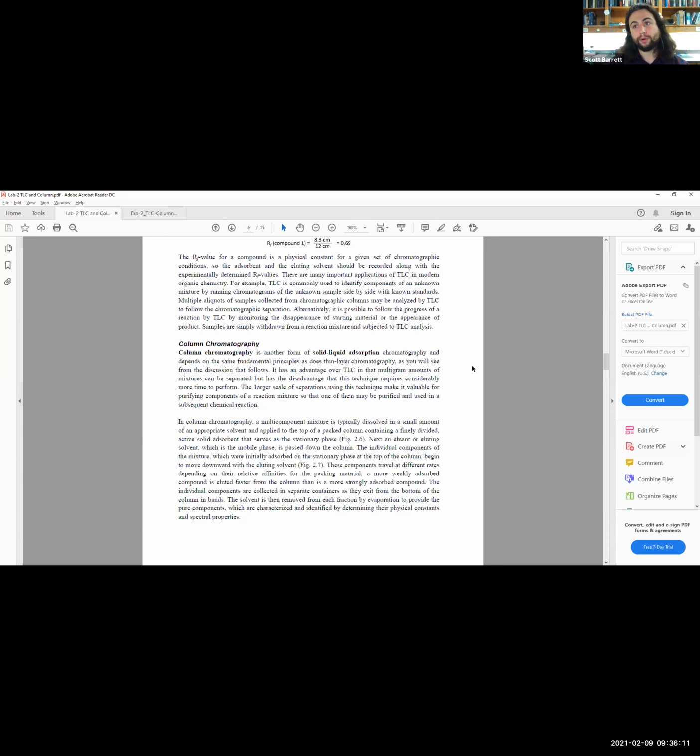However, if it's more non-polar, you can place it onto the plate and then it'll slowly move up with your solvent or mobile phase that's non-polar. So we want to make sure, guys, to remember the like dissolves like principle here is super important, because when you utilize a compound, most likely it's not going to be water. You're not going to place water onto your TLC plate. There's no reason. You're going to be using these ambiguous compounds that may have slightly more polarity than the others, or the opposite, might be more non-polar.